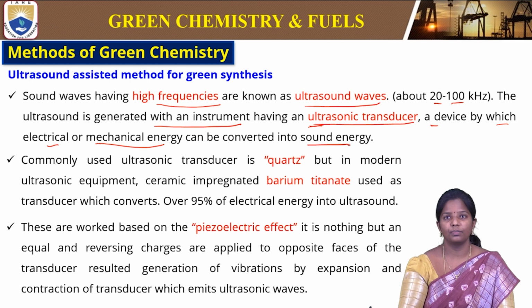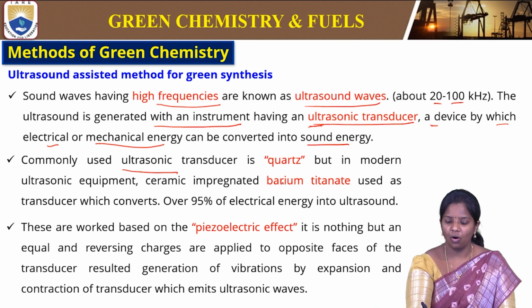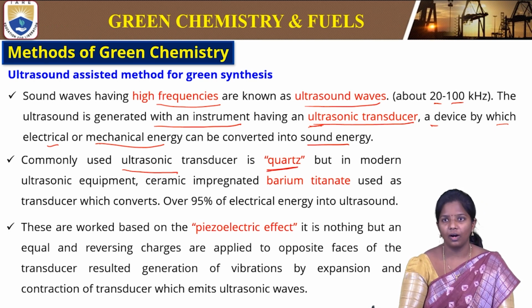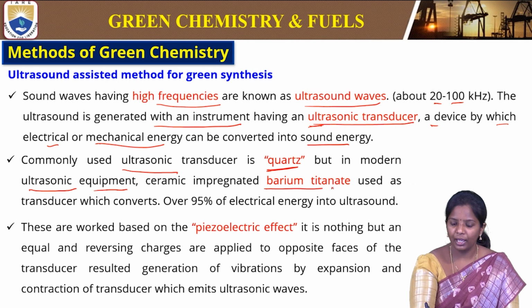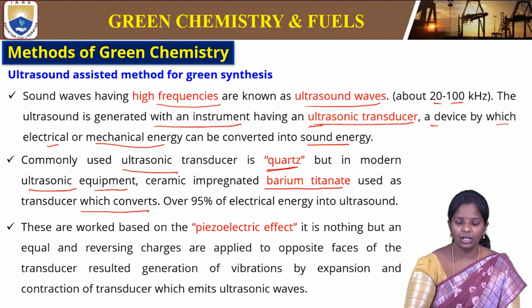The commonly used ultrasonic transducer material is quartz, but in modern ultrasonic equipment, ceramic impregnated barium titanate is used as the transducer, which converts.